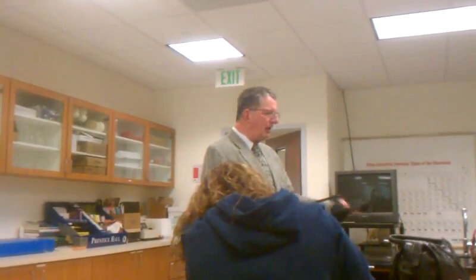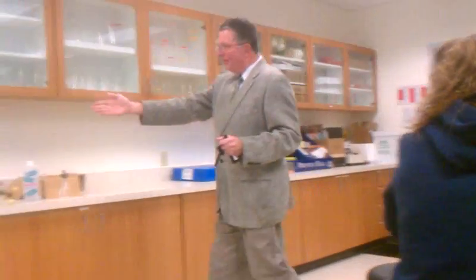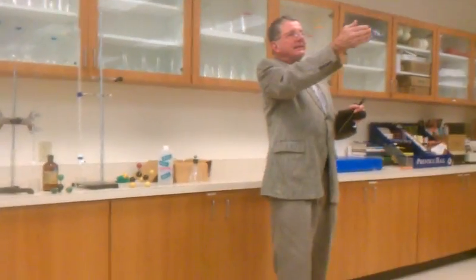electrical charge. Well, I've got a piece of wool, and I've got a little piece of black plastic here. If I rub wool with plastic, it turns out it puts a negative charge on this piece of plastic. And because acetone, for example, is polar, it has a negative end and a positive end. So if I bring this negative charge up to the stream of acetone, it should bend the stream, because the positive end of the acetone would be attracted to the negative end of this rod. And you'll see that happen.